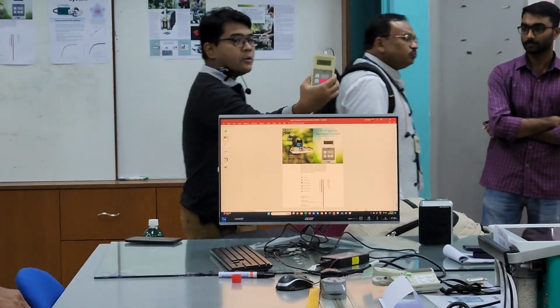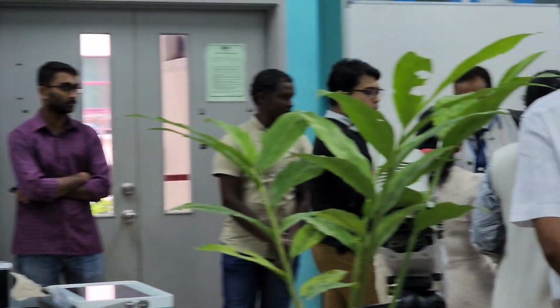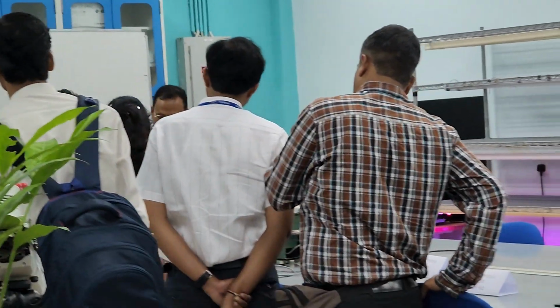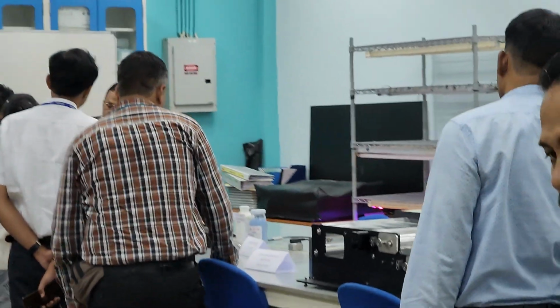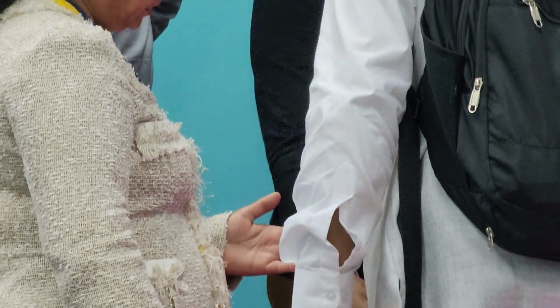So now it only reads 0.4. No, 0.4 micromole. So I can use this actually. We've got the growth light here from Philips. If I put it just right here, that's not sunlight, so it's increasing. Yeah, immediate.